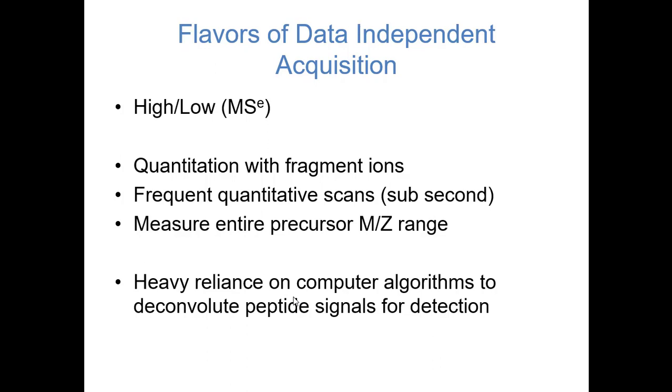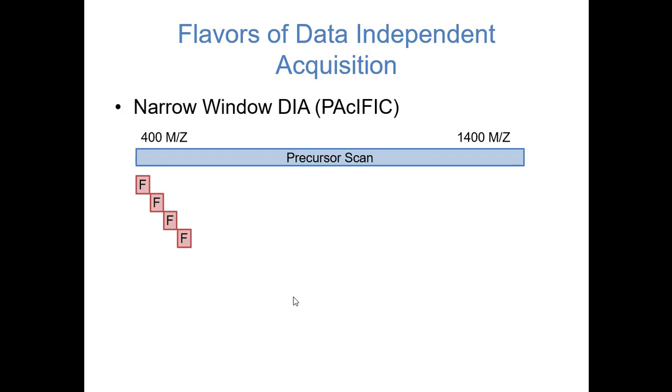Now this benefits substantially from more modern techniques like ion mobility, and so they've modified this to be what they call HDMSE, but that's the way this framework works for MSE, Waters-style DIA.